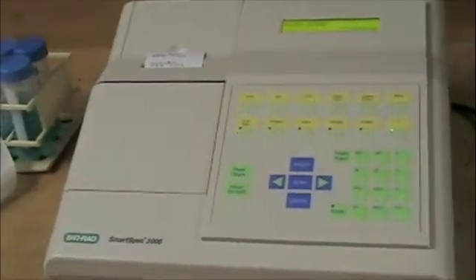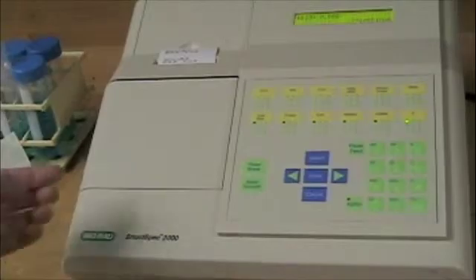Now the spectrophotometer is blanked and is telling me to continue — we are ready to read our first sample.